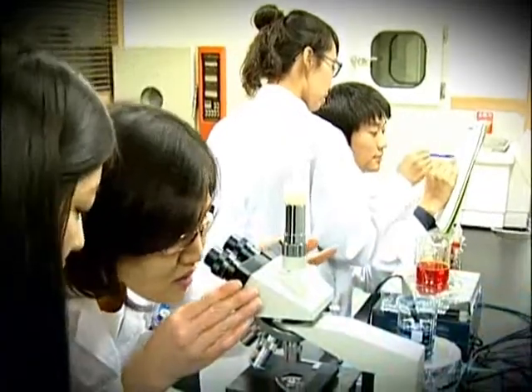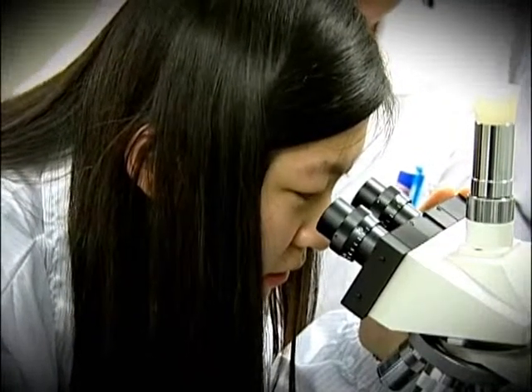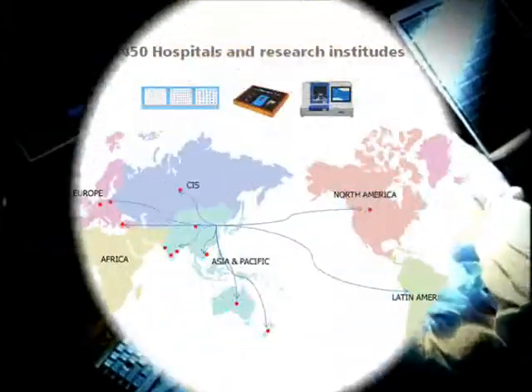Unitma recently developed the Automated Tissue Microarrayer to offer equipment that implements the most innovative TMA technology to major organizations all over the world.